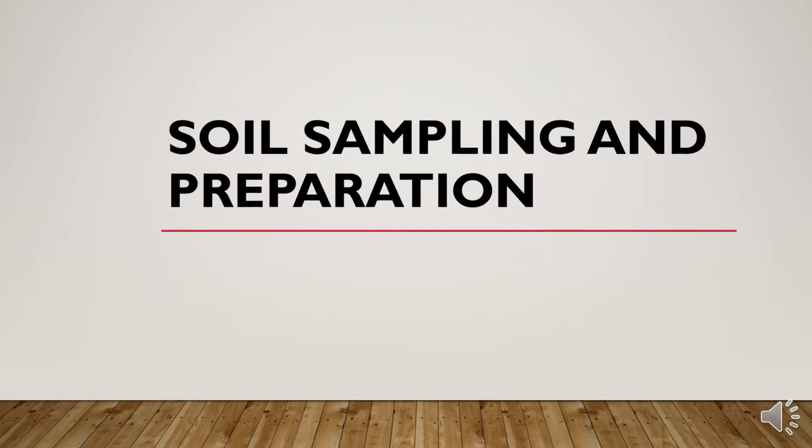For soil sample collection, a sample should be composed of several subsamples representing a seemingly uniform area or field with similar cropping and management history.